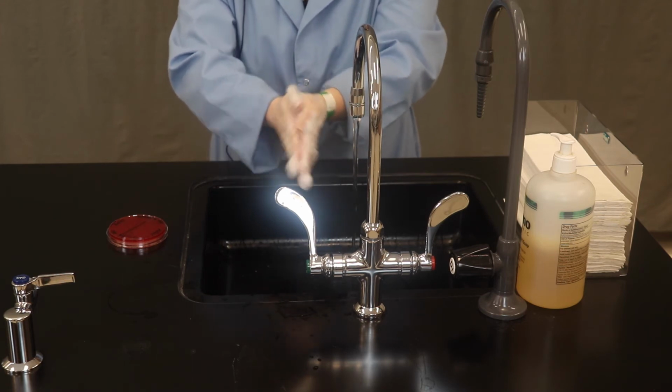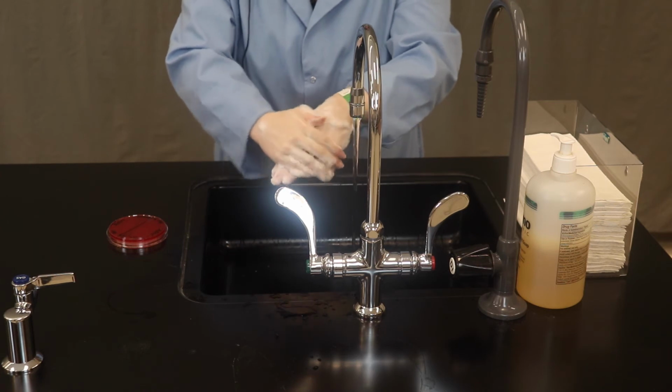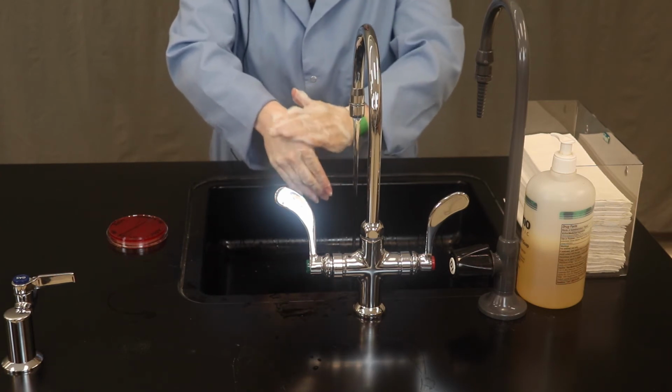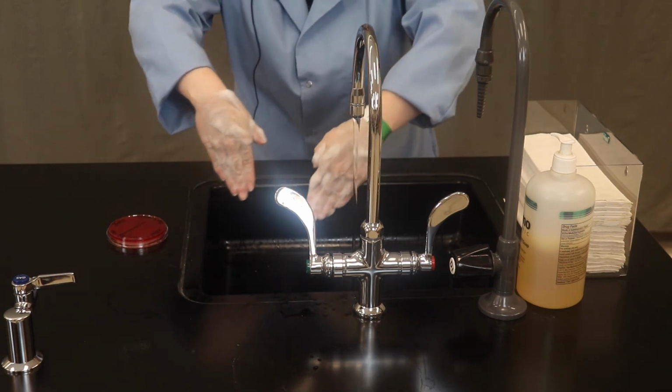Really sudsy. You could start to go up your wrist a little bit if you wanted to. It's hard because I have a lab coat on here. And then when you're finished, you're going to rinse down the drain like so.